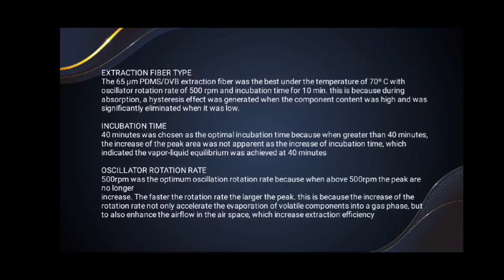Incubation time. 40 minutes was chosen as the optimal incubation time because when greater than 40 minutes, the increase of the peak area was not apparent as the incubation time increased, which indicated the vapor-liquid equilibrium was achieved at 40 minutes.